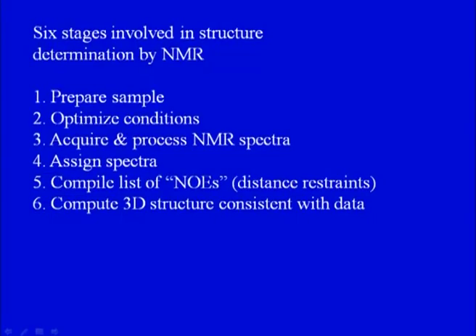For proton NMR, the sample has to be dissolved in proper solvents, and if it does not contain NMR-active nuclei like 1H, or say for proteins 13C or 15N, then those have to be put in there. Then optimized conditions have to be created for the experiment. After this, the NMR signal is recorded on the machine and the NMR spectrum is obtained.